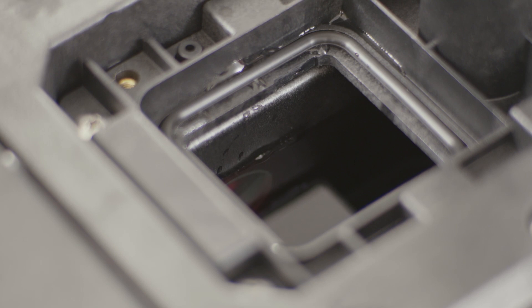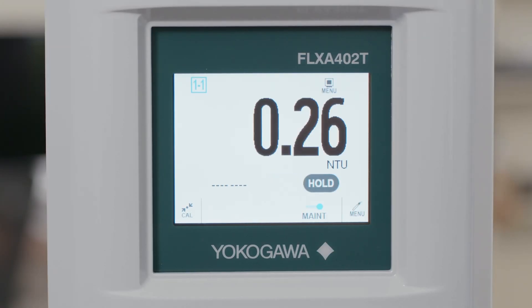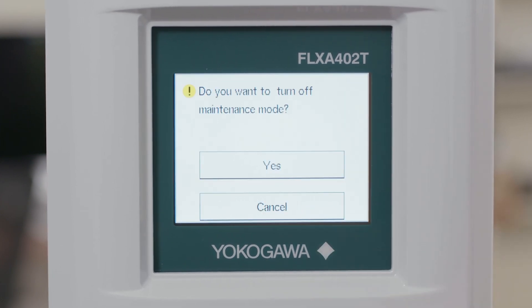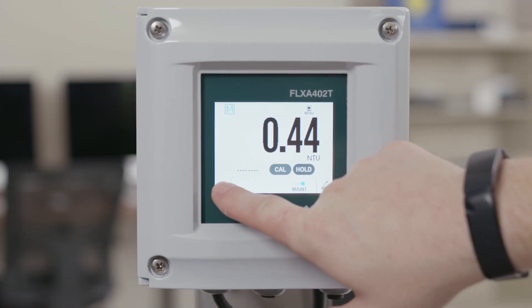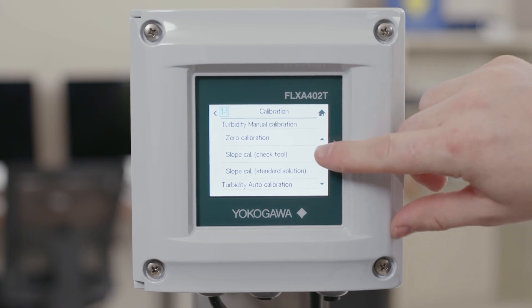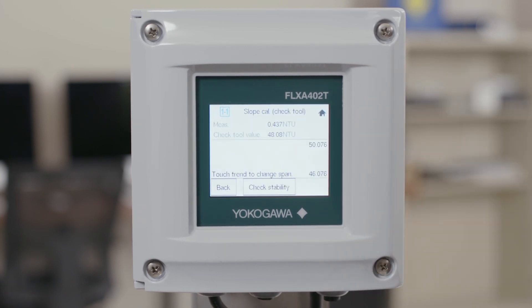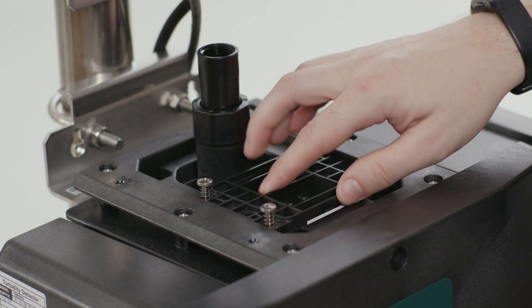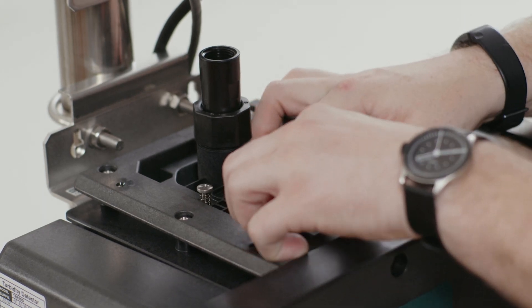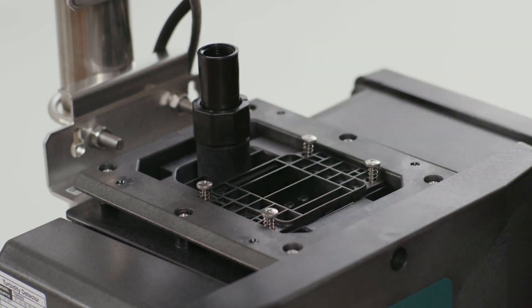Leave your zero water in the analyzer for this portion as well. Make sure that your analyzer is in maintenance mode — if it asks if you want to turn it off, just hit cancel and we can go ahead and start the calibration. The calibration we're going to select is calibrate with check tool. Clicking this you'll see a screen very similar to the zero calibration, but instead of having a zero value, there is a large number usually in the 30 to 40 NTU range. Verify that this number is the same as what is on your check tool. If they match, slot the check tool into the position where you took out the plastic window, and loosely tighten it down.